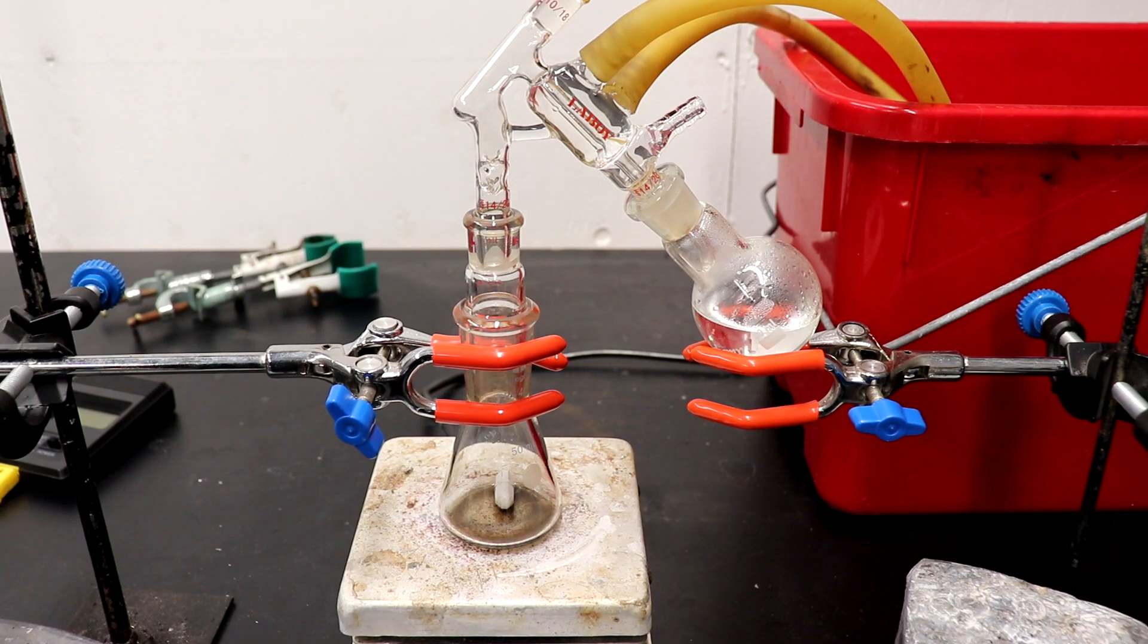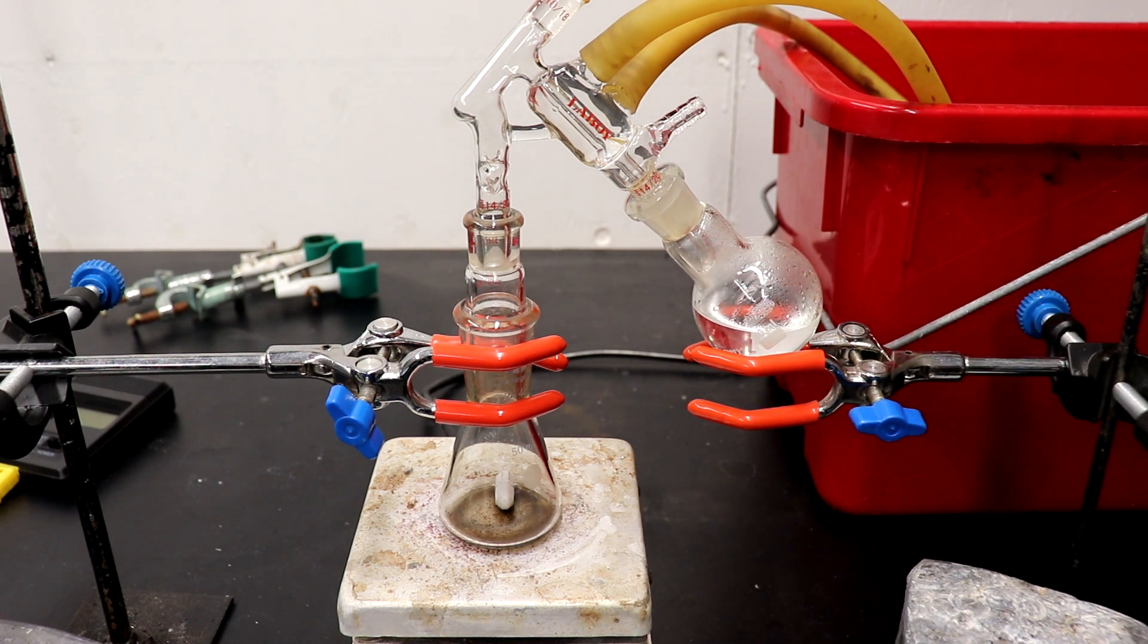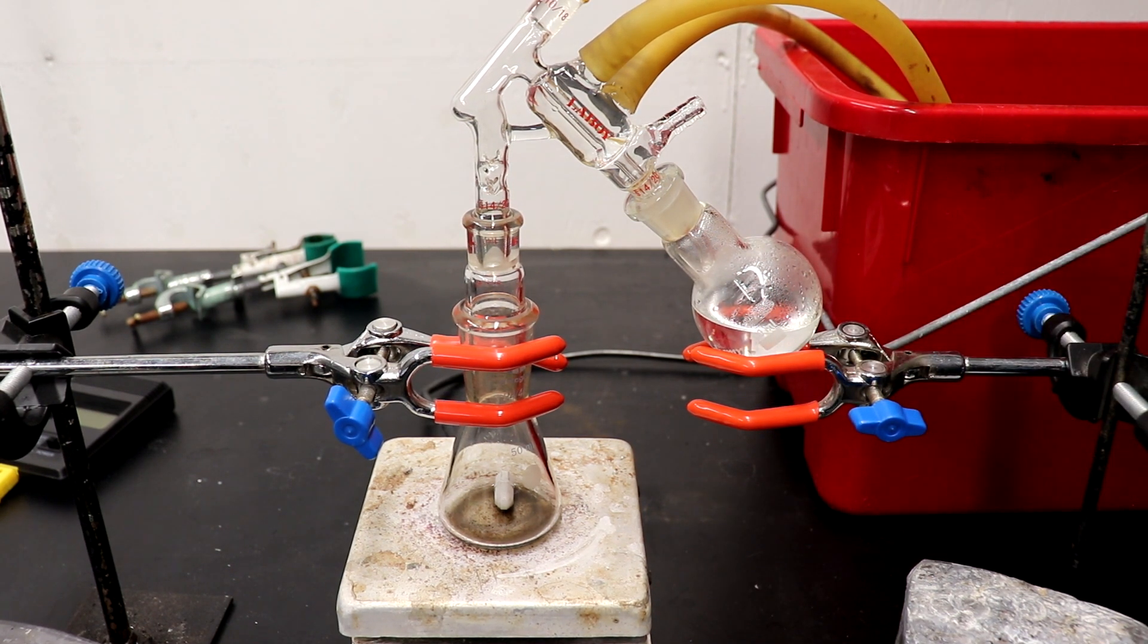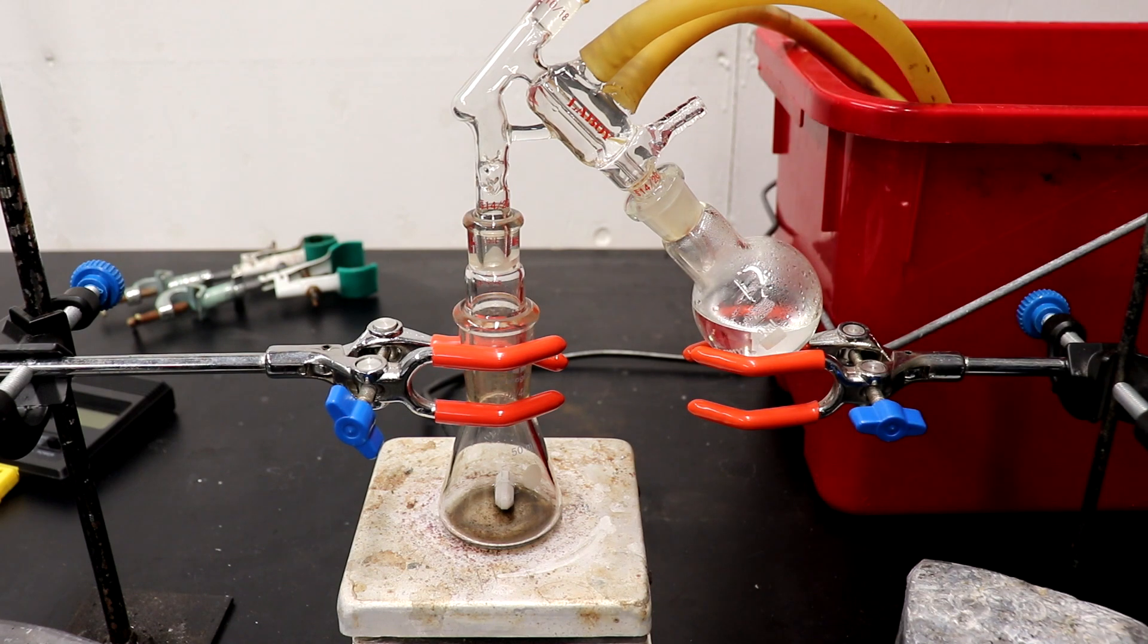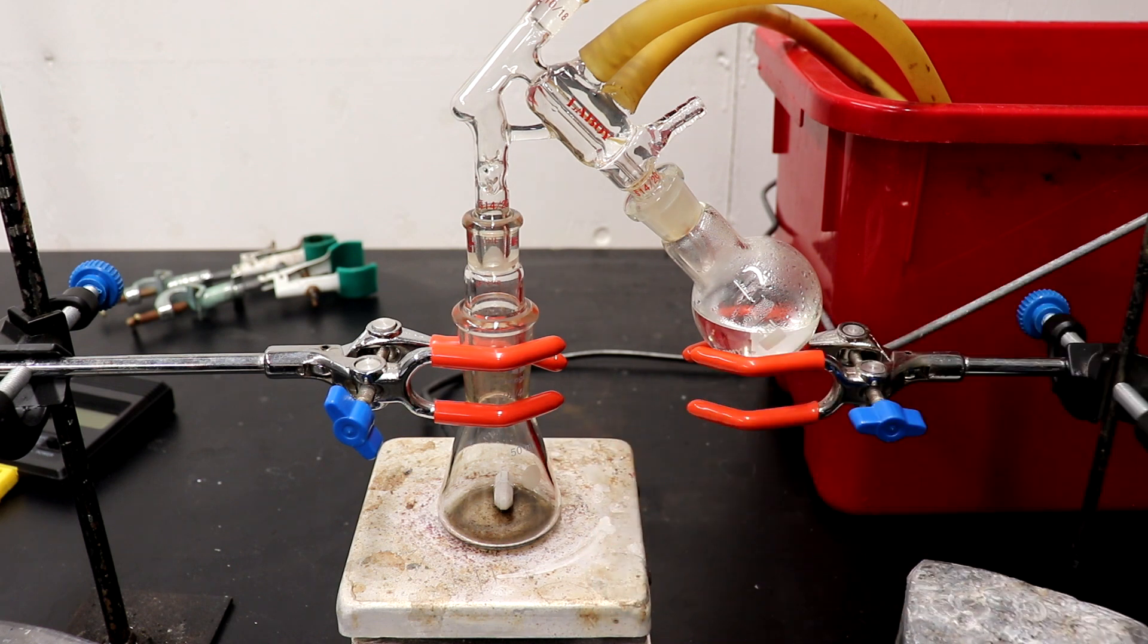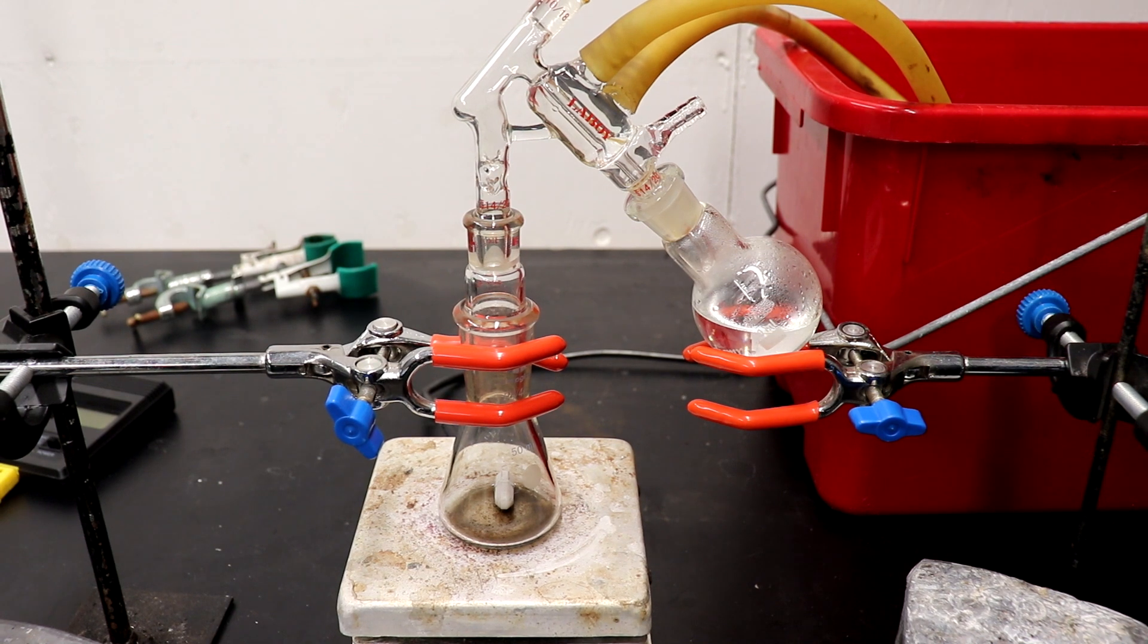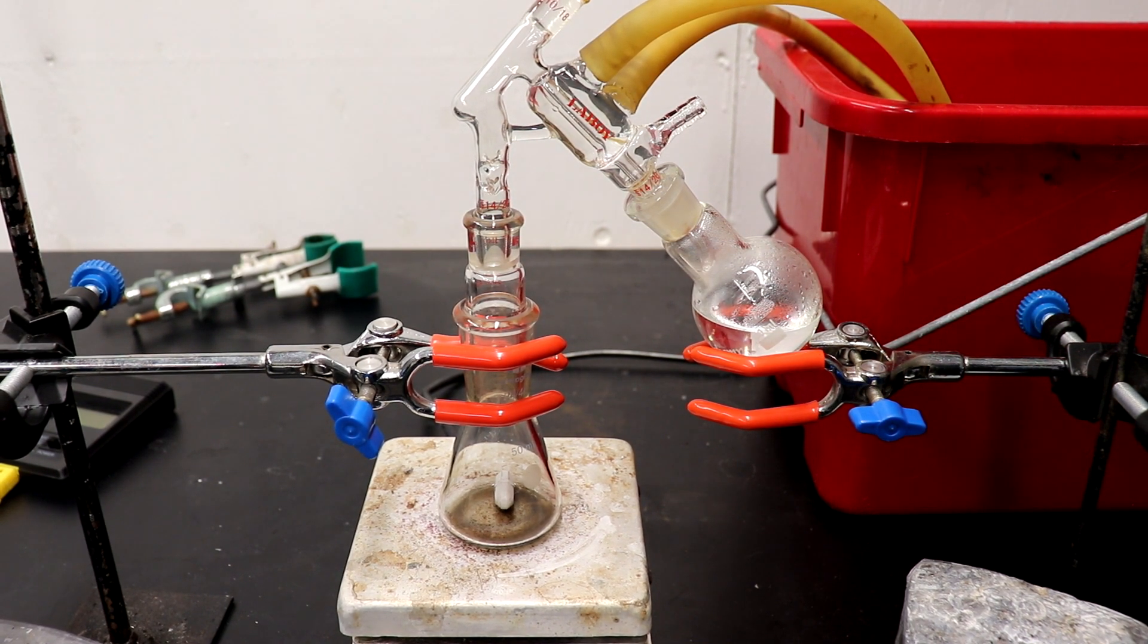The distillation is finished. I've collected most of the 1,4-dibromobutane. There is a tiny amount of forerun, really not much to be mentioned, maybe half a ml, and there's probably about half a ml left in the distillation flask as well. Really, it was all 1,4-dibromobutane, which is great. So now I'll weigh it out, put it in a bottle, and we'll calculate the yield.